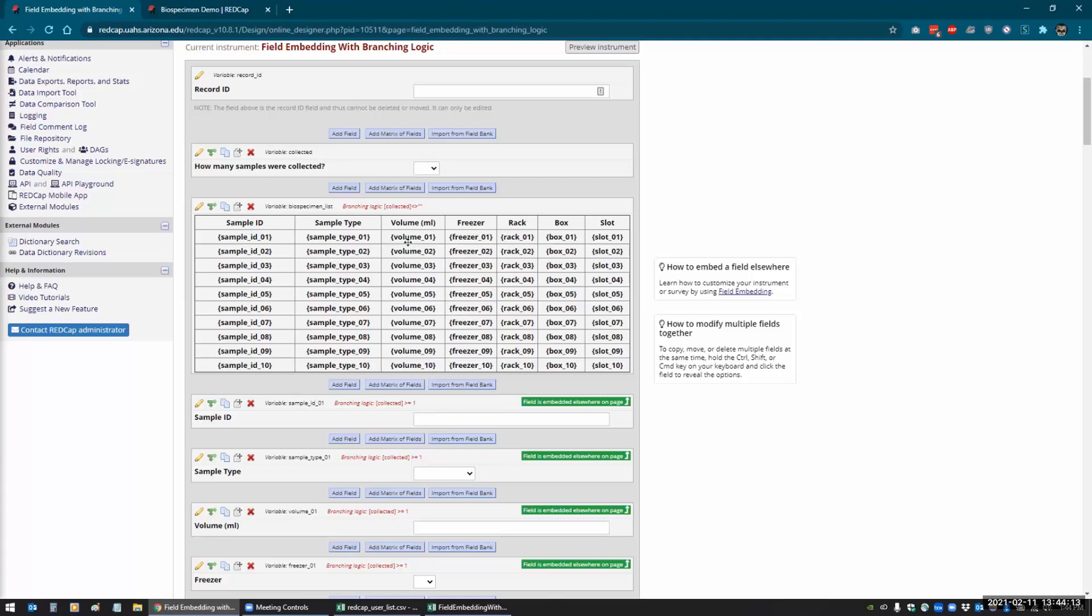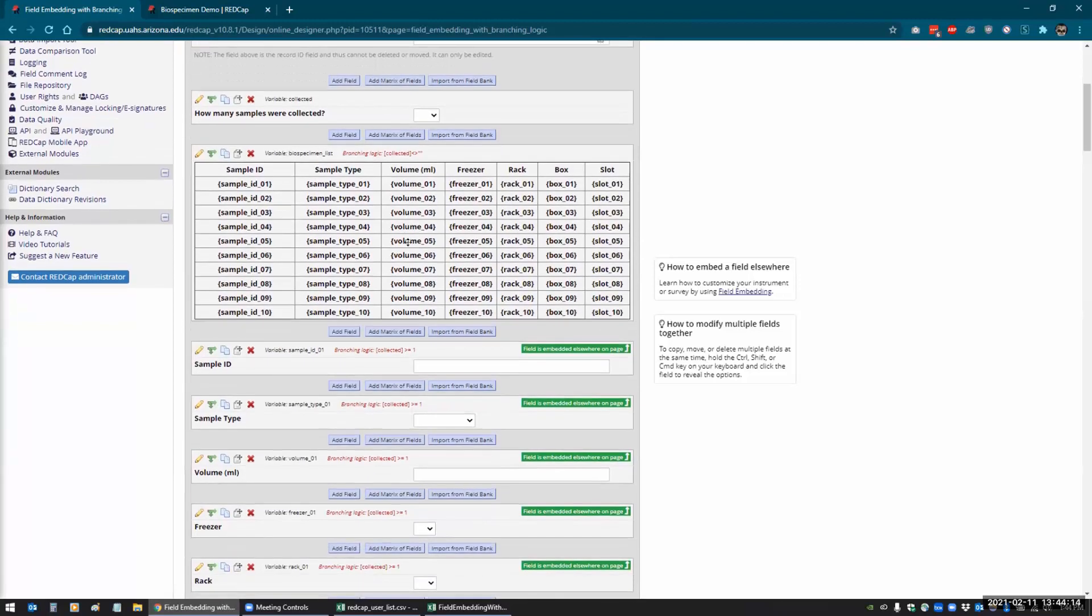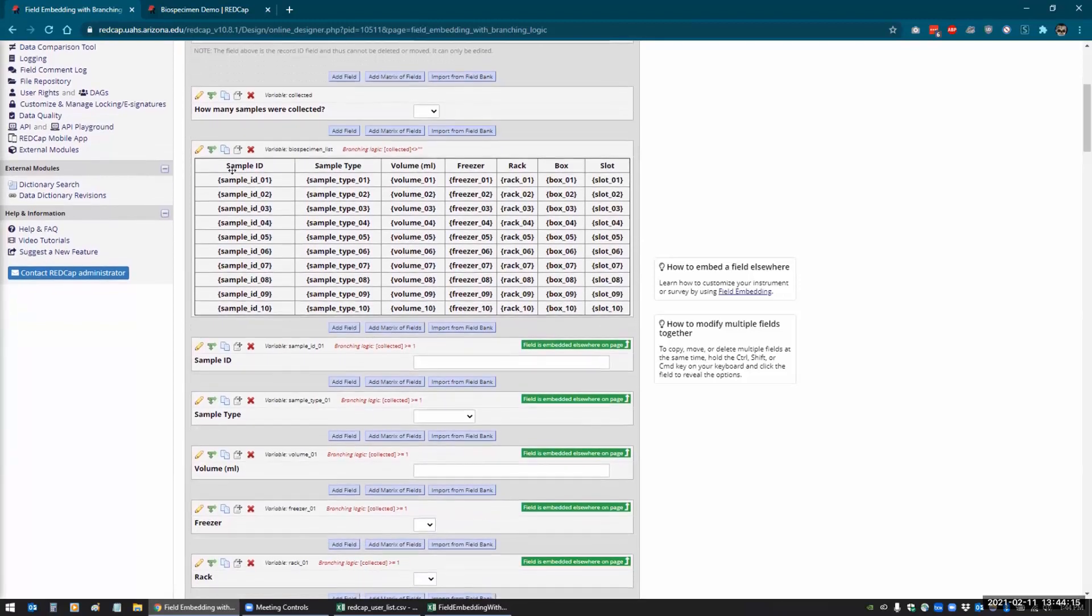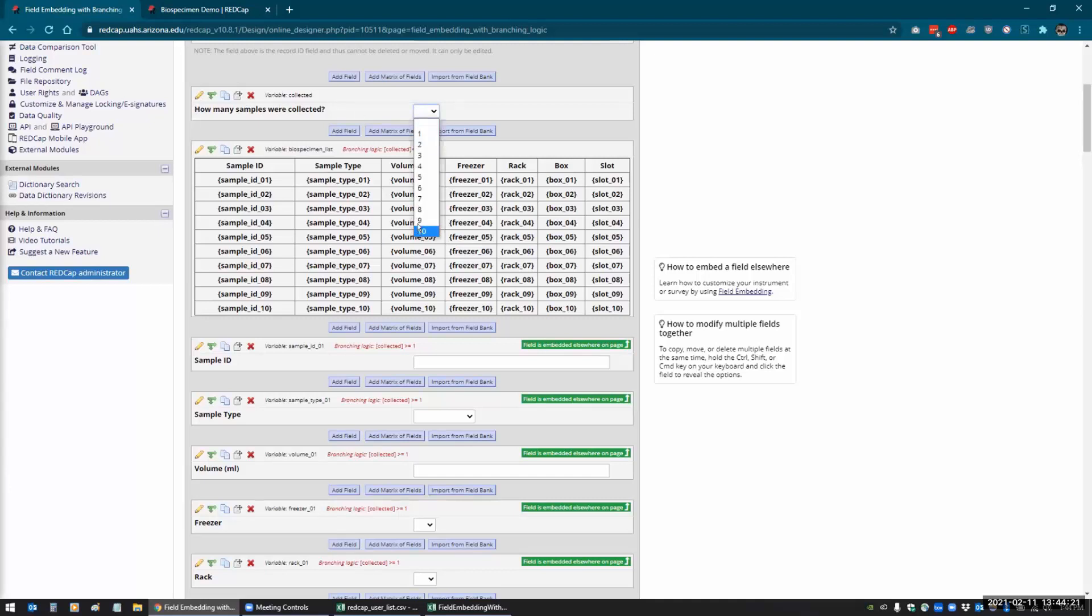And then all you do is you set the branching logic for each field. So I have the branching logic here for the table to only show up if this has a value in it. So if I don't select a sample number, then it won't show up.